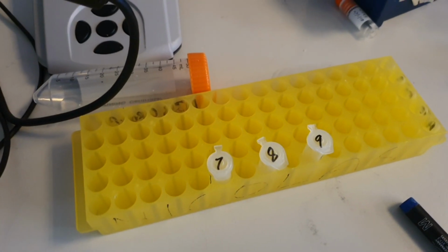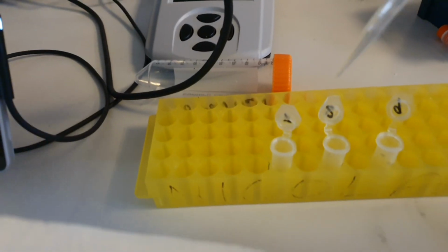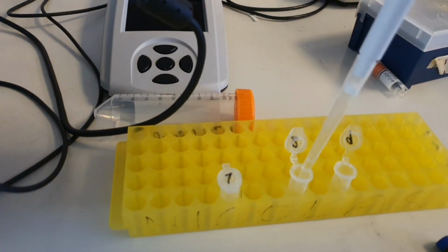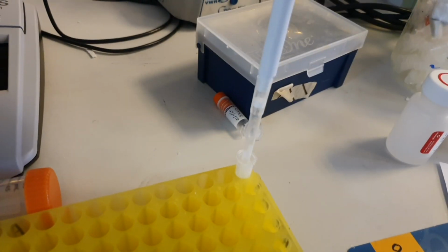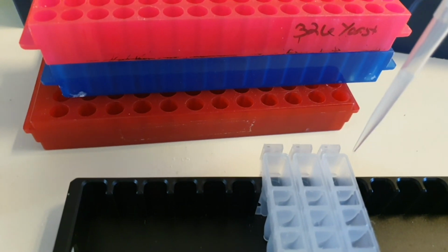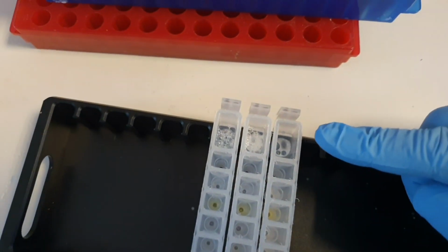Once the cells have been lysed, the next step is to add 200 microliter of lysis buffer. We take 200 microliter and add to the lysate and mix well. Similarly, we proceed with the other samples. You should vortex vigorously to mix well. Next, we take all this 400 microliter of the lysate and transfer it to the first well, which is the bigger one. Similarly, we take the other samples. So we have added the samples to well number one.